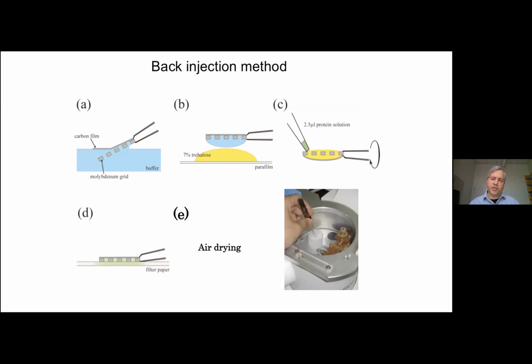And then once you froze the crystals, it was also a different method. It wasn't simply getting a Quantifoil or C-flat grid and adding your sample and plunge freezing it. Since it's a 2D crystal, you want the crystal to lie flat on a carbon layer. So you'd have to make your own carbon, which is nice and thin, and put it onto a grid. Usually you'd have the carbon film in water, you put the grid in and lift it up so that the carbon film lies on the grid.